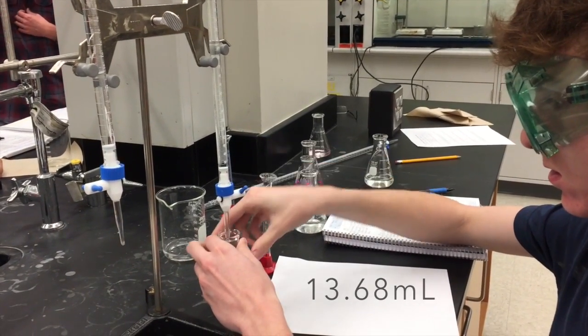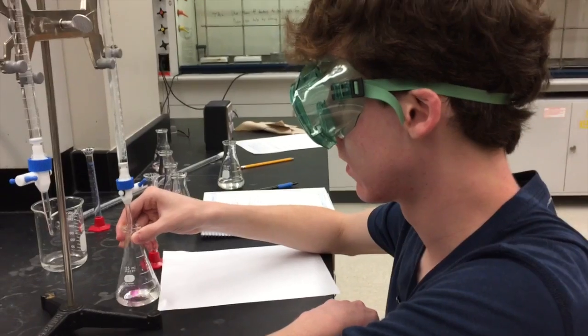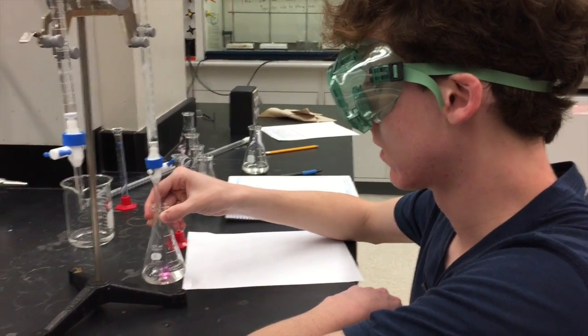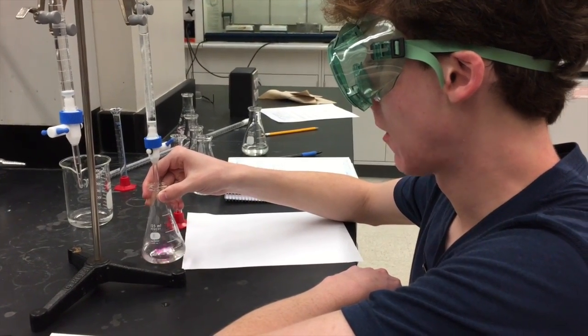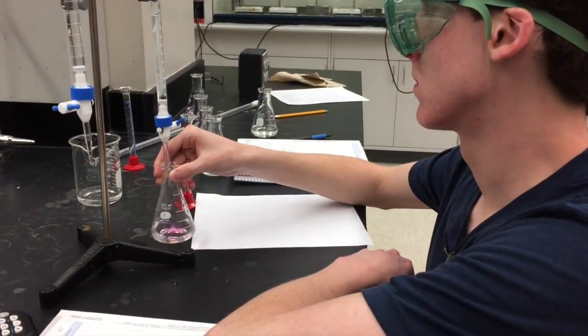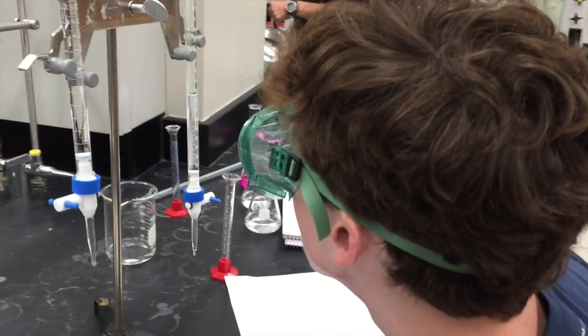Open the stopcock to allow sodium hydroxide to flow out and swirl the Erlenmeyer flask to allow the reaction to occur more quickly. When the solution turns a little pink, slow down. The titration is finished at the endpoint where the solution becomes a light pink color. Record the final volume.